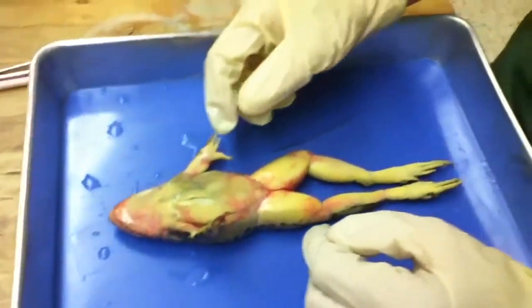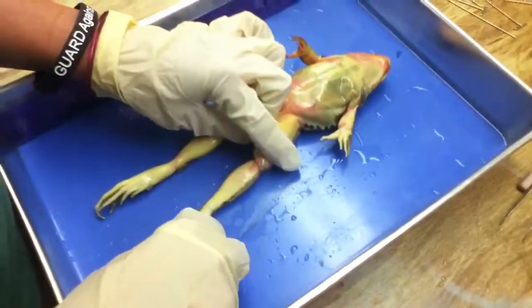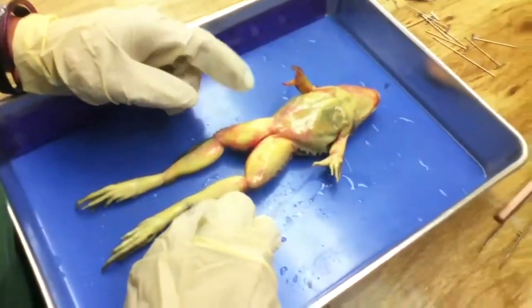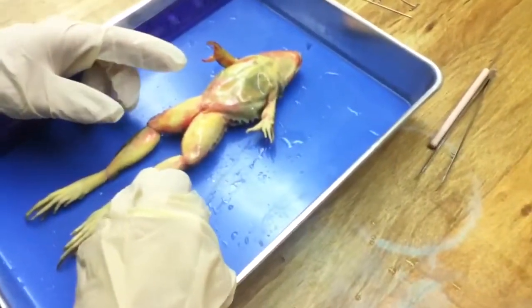Observe several features. Okay. Measure the length of your frog. Stretch the hind leg straight. Oh, did you do that already? When you measured it? Okay. Review the following information about the frog's head. It says draw and label the frog's head. Do I just draw this? Yeah, just draw it.